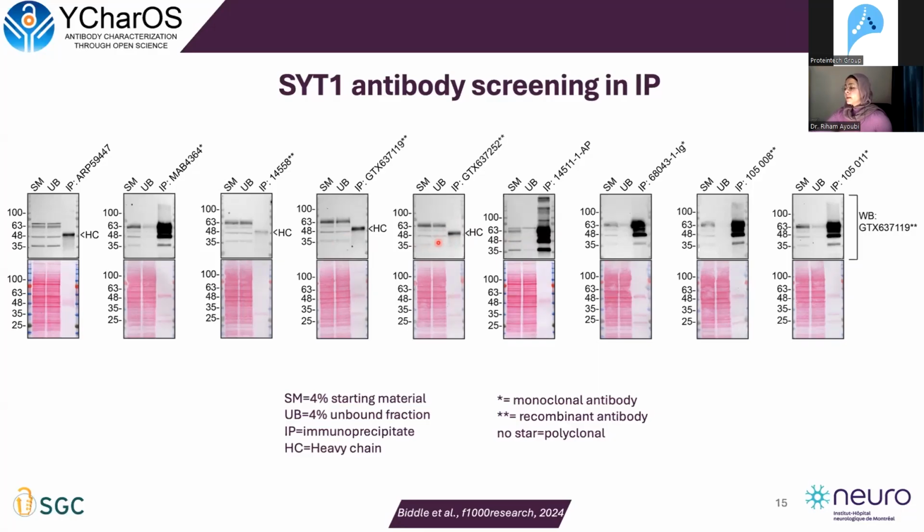And as compared to the starting material, you can also notice the enrichment of synaptotagmin-1 for further analysis like mass spectrometry.